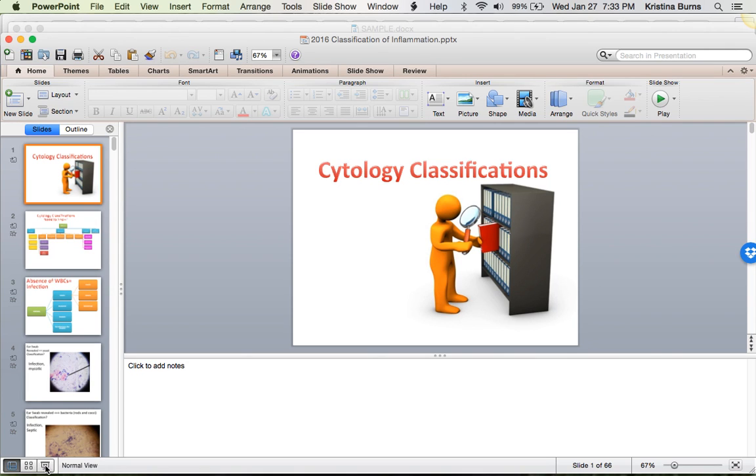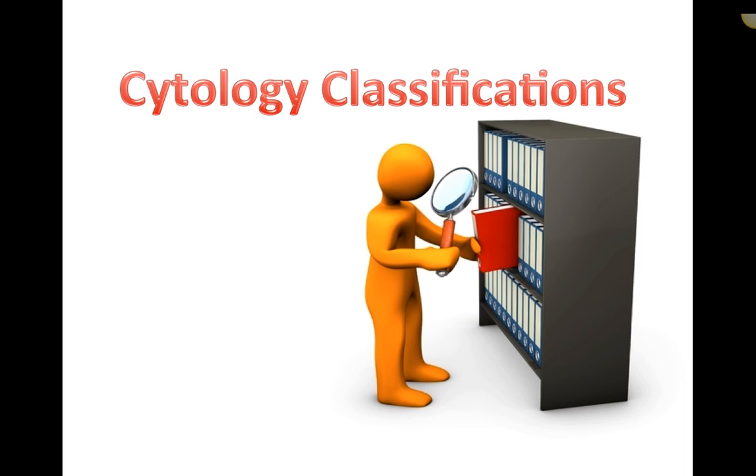Let's look at classification of cytology. It's a big presentation because it's incredibly important. The outward goal in the end is for you as an RVT to get a slide in front of you, be told where it was taken from, how it was collected, how it was prepared, be able to look at it once it's stained, and identify what the heck you are seeing.